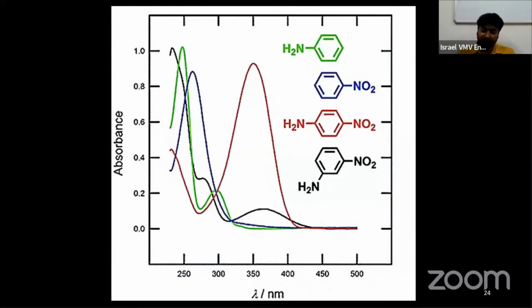And that is not much possible in the fourth molecule. You see the NH2 and NO2 groups are in different positions. They are not exactly opposite in position. And that makes a difference in the absorption spectrum. Leaving out the first molecule and the second molecule.